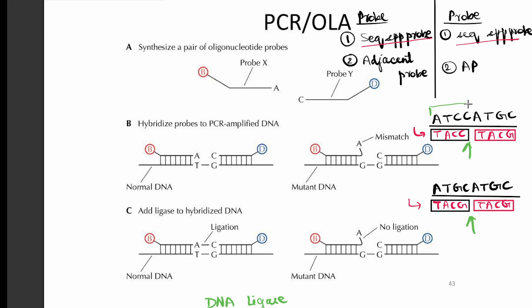See, if the complete matching has been done and the probes have completely aligned to their parental sequence, then the ligation will occur and that oligonucleotide will be sealed. But suppose this is not the case and there is a mutation. For example, this was our parental DNA, although it is mutated, but it is a parental DNA, not probe. So suppose here it was GG and the probe which you have added here has the A. So A is not complementary to G, so A will remain detached. Once this is detached, there cannot be ligation in any of the possible cases.